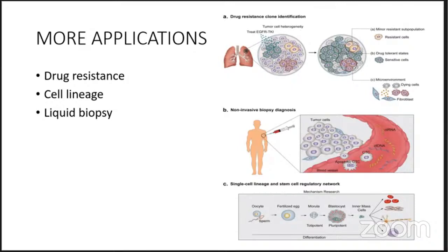Single cell RNA-seq can tackle this problem by effectively identifying the subgroups based on the responsiveness in various contexts, whether it is mutated or not mutated, whether it will be drug sensitive or drug resistant. So all these phenomena are possible with the help of single cell genomic data. If we look at the lineage, as I already told you, it can also identify novel differential markers.